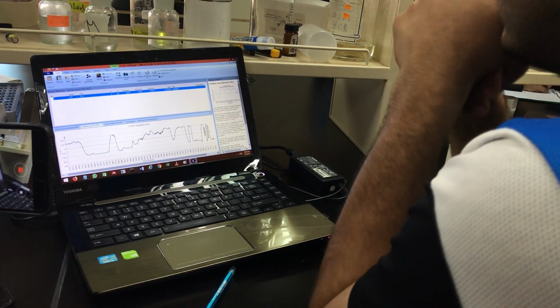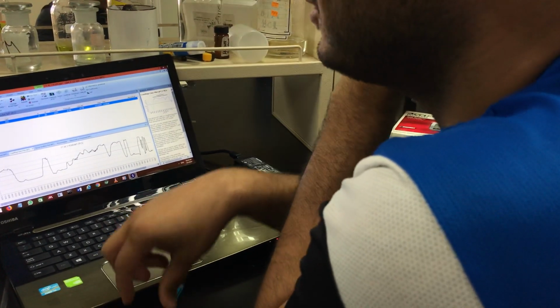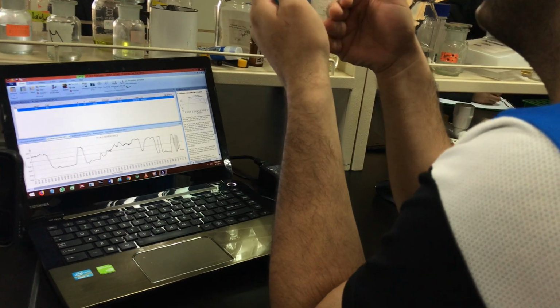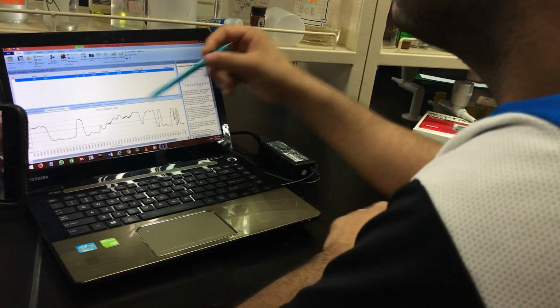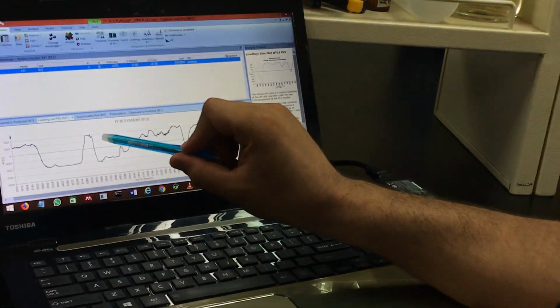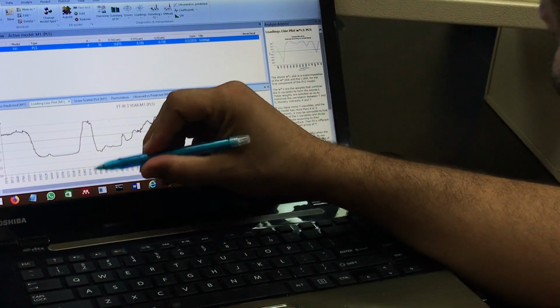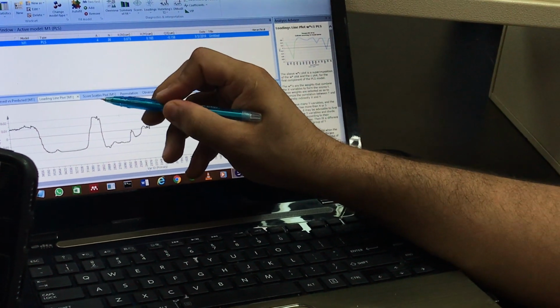So what can we discuss in our discussion? Even like this, you will give the reason, but however, you have to discuss the functional groups. What are the compounds that contain these functional groups? Let's see here, this is 3000, this is CH.